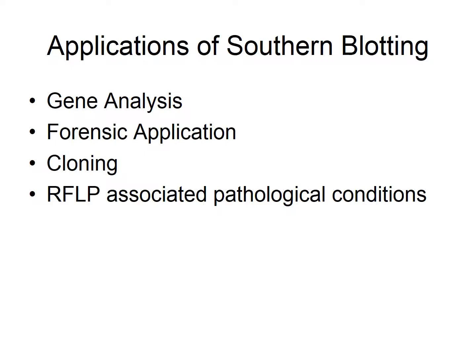Forensic application: well, restriction fragments, which produce different sequences, are also used in forensics. I'll show you an example of it in the later slides. You can identify an unknown sample to a given individual by using these techniques.